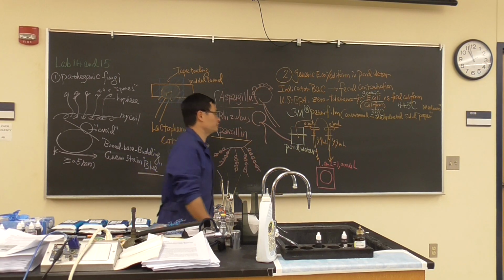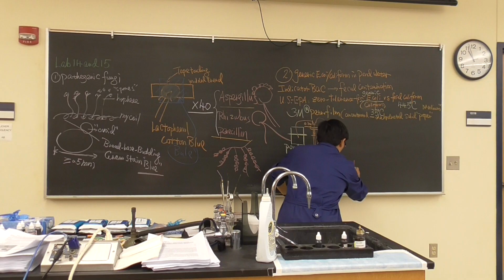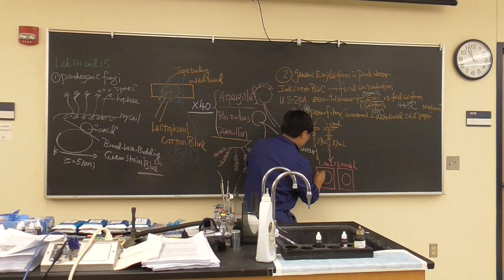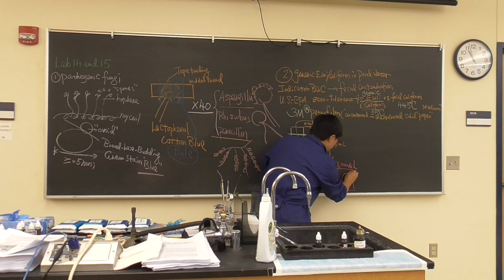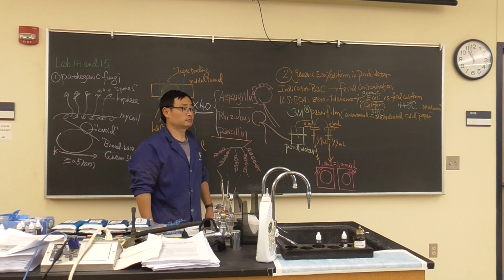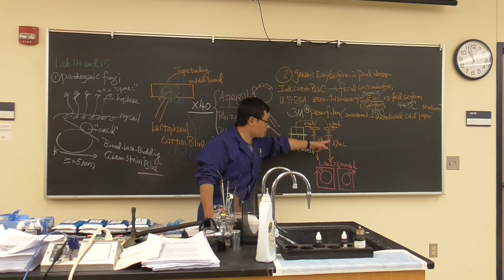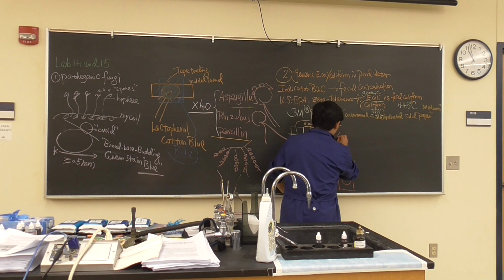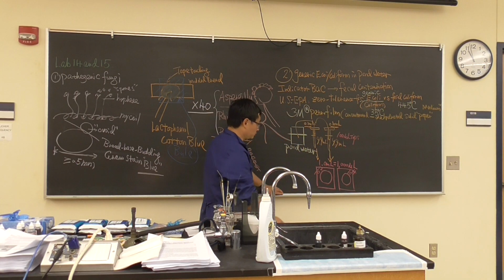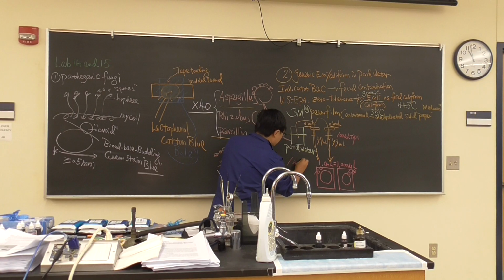So, what's the final dilution factor of these two? That's a very simple math question. It will be 10 to the power of 2 and 10 to the power of 4. Okay? So when you prepare the dilution, use 100 microliter tips and pipettes; when you add onto the petrifilm, use 1 ml tips.